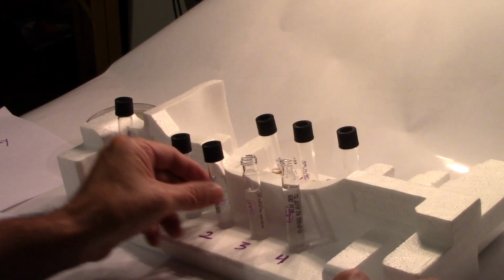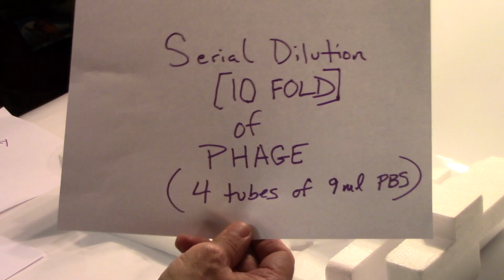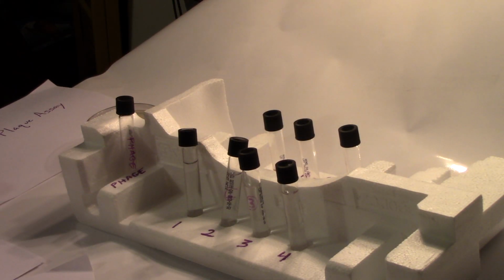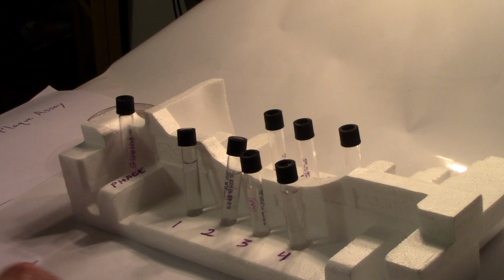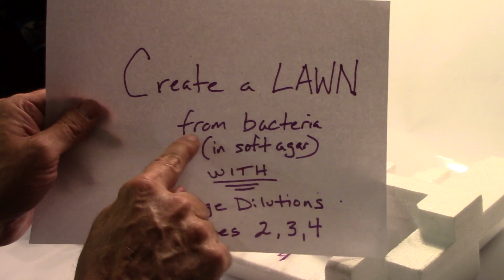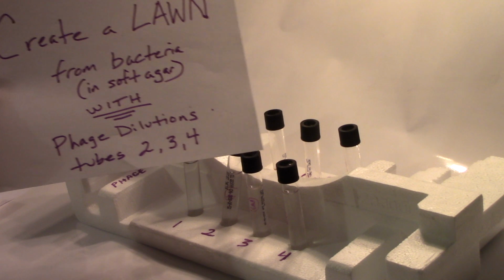And then what we're going to do in the next step, so far we have a serial 10-fold dilution of our phage. What we're going to do is use this soft overlay agar with the bacteria in it that now has phage in it. So now we're going to create a lawn using bacteria in the soft agar with the phage dilutions from tubes 2, 3, and 4. I'm going to pour these onto my plates.